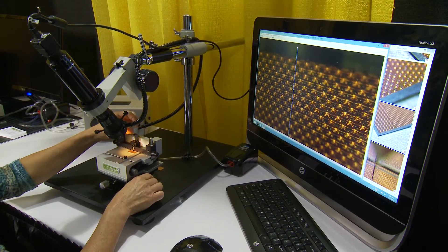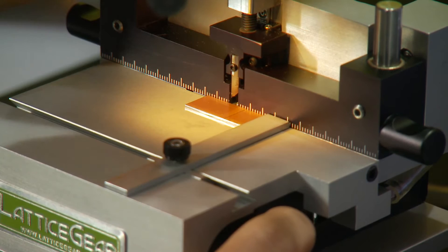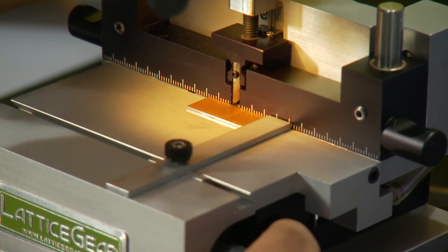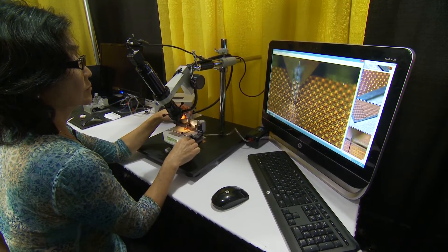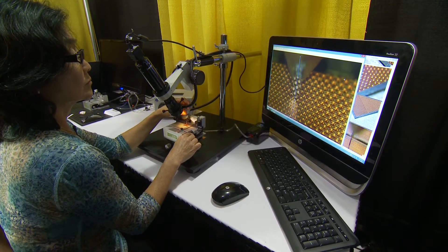you can use the software tools to select a cleaving line and draw it from the target to the leading edge. By doing so, going to the next step, using the indenter knob and turning it, moving the indenter tip down to the surface of the sample, and aligning the tip with the cleave line. This will secure an accurate indentation at the correct location and the cleave of the target.